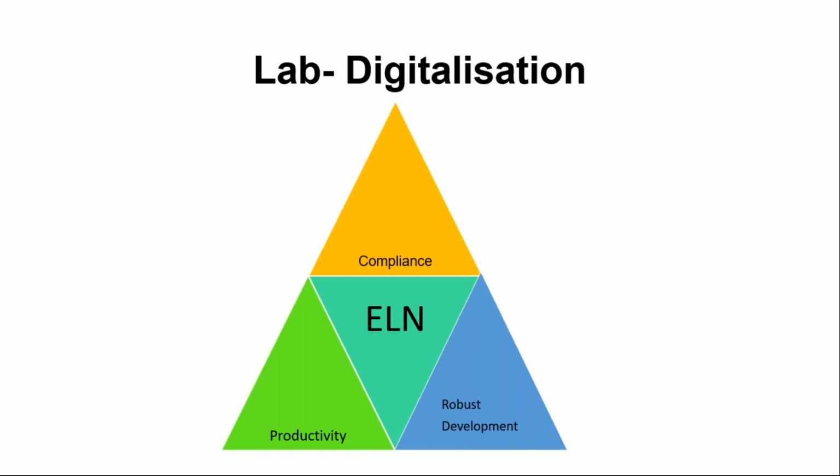But at the same time, the digital systems, when designed appropriately and adequately, have a lot of elements which can provide inbuilt compliance to all the data and the processes which are generated within the digital systems. And as per my perspective, electronic lab notebook is one of the centralized applications covering a lot of lab processes within it, very key processes like all your experiment recording, as well as your instrument management, as well as connecting with the databases.